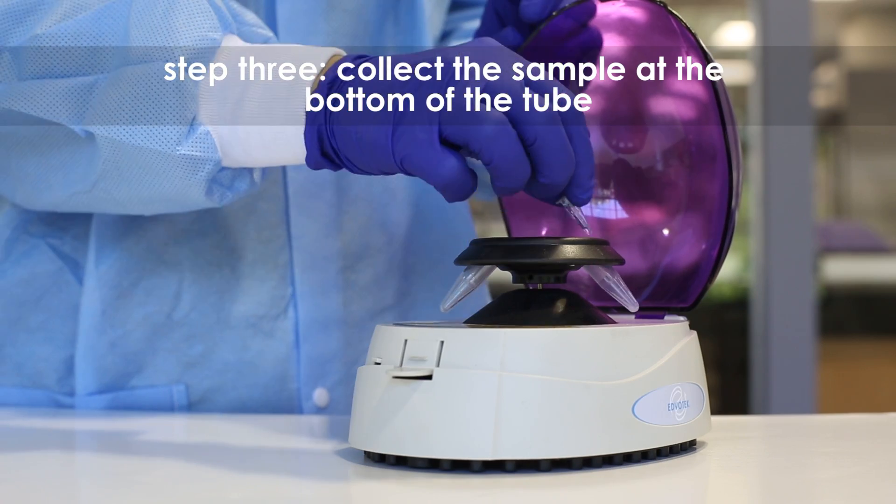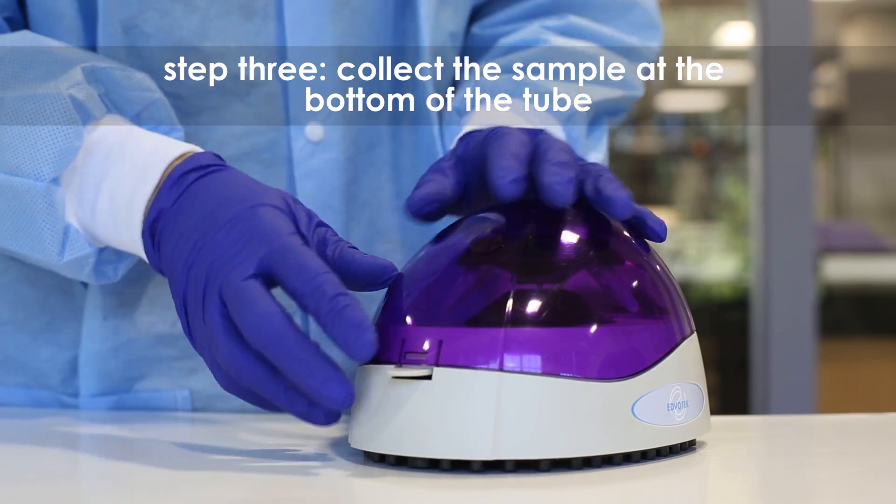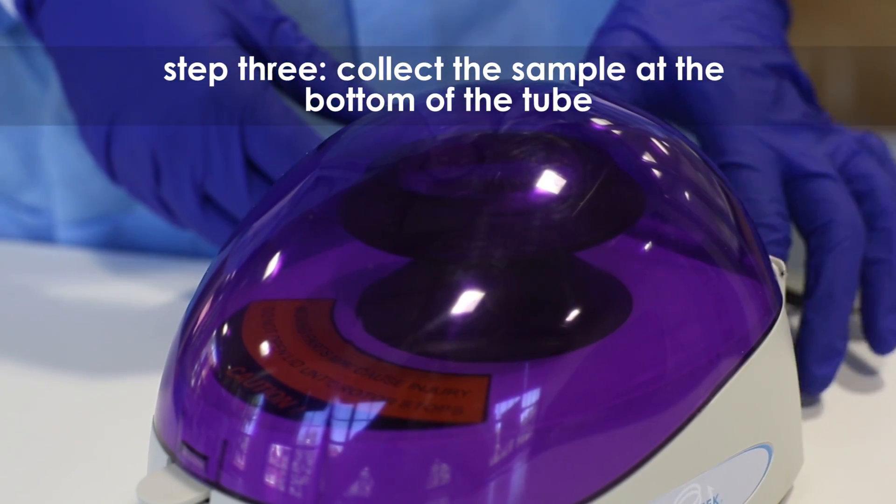Step 3: Collect the entire sample at the bottom of the tube. You may use a microcentrifuge to help with this process.